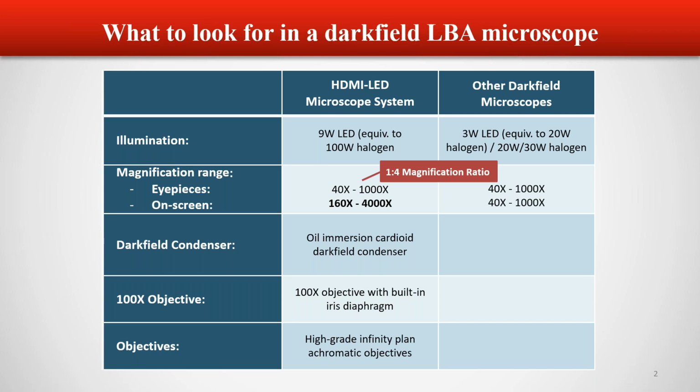All right, and then the magnification range on all other laboratory microscopes, they're configured so that the magnification through the eyepieces is the same as on the screen. It's a 1-to-1 magnification ratio between the eyepieces and the screen.